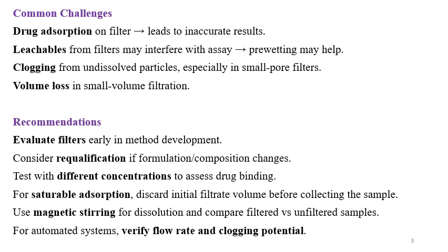Test with different concentrations to assess the drug binding, because in the dissolution at the early time points less amount of drug will be released, but it will go on increasing, and at some point it will reach a certain level. So testing with different concentrations to assess the drug binding is very important.